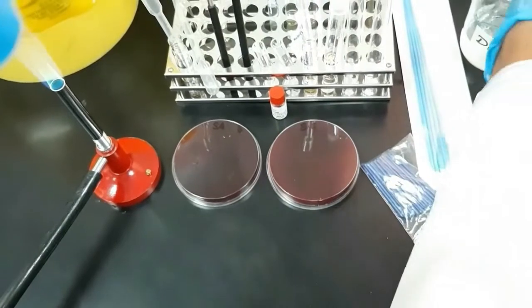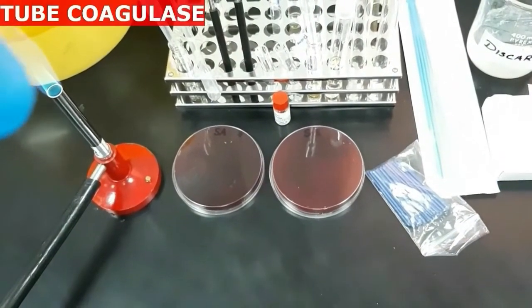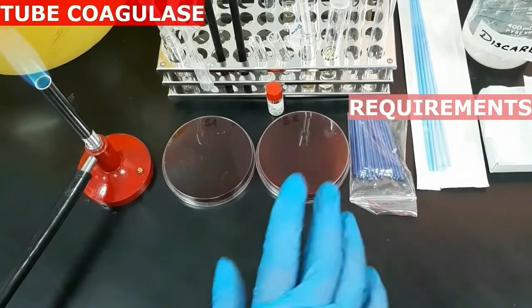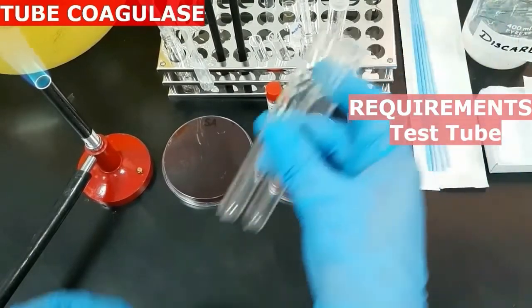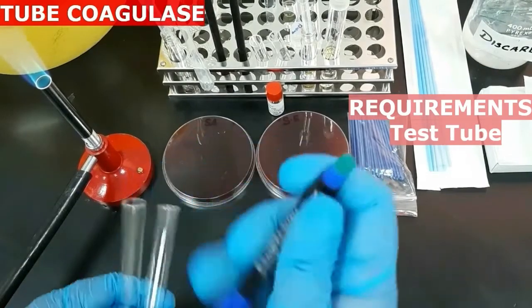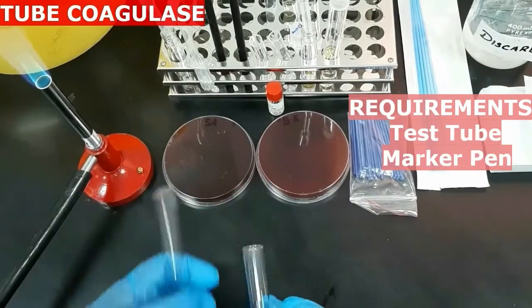So next we will start with the tube coagulase test. Let's see the requirements needed for the tube coagulase test. Two test tubes, and mark one as a positive control and the second one as a negative control or a test sample.